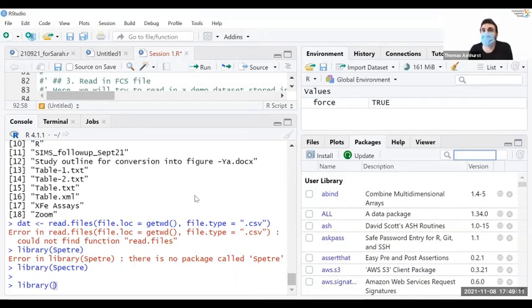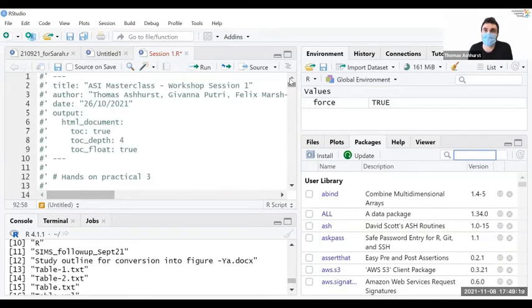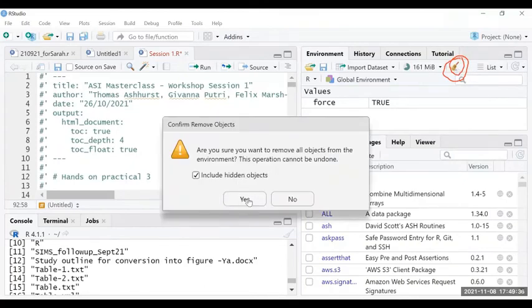Let me get my little annotate thing going here. You could hit that button first, the little broom. Is it a broom? Yeah, it's called a broom. That'll delete everything that we've done. It won't delete the script. It'll just delete anything we've run, all the variables. That's often good, going from the start, so to speak.